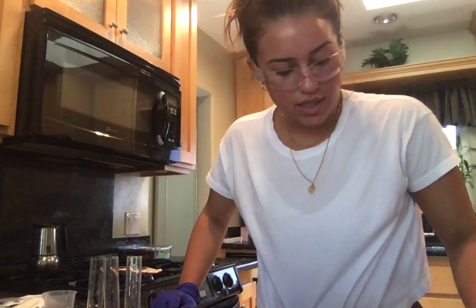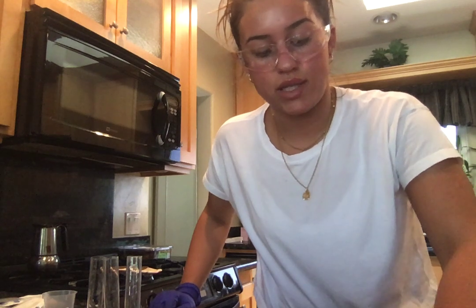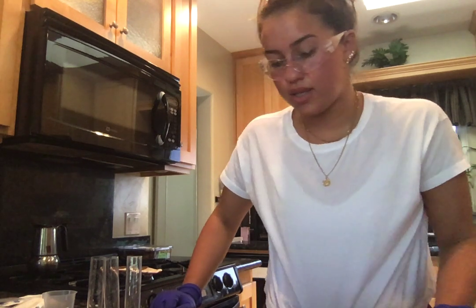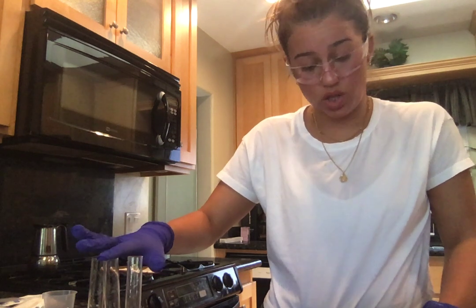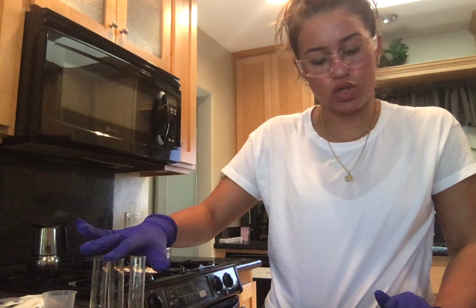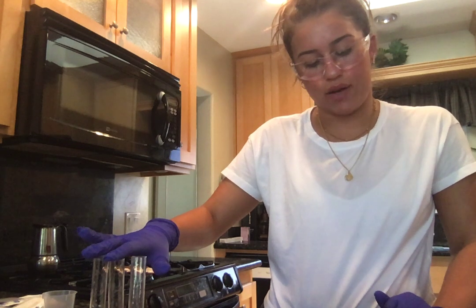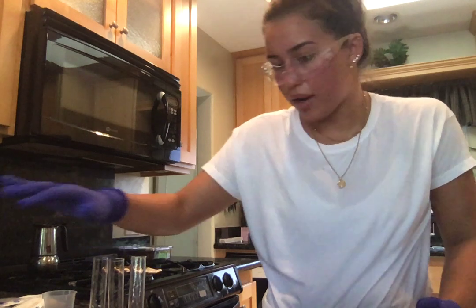Hi, so this is going to be my step five in experiment six, acids and bases. And so now I'm going to take my test tube two that has the 10% grape juice solution, and I'm going to add 15 drops of saturated sodium bicarbonate.